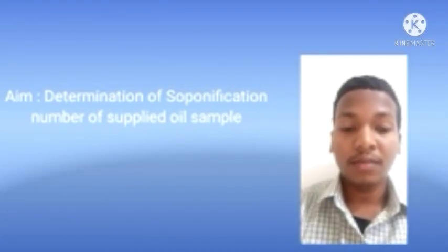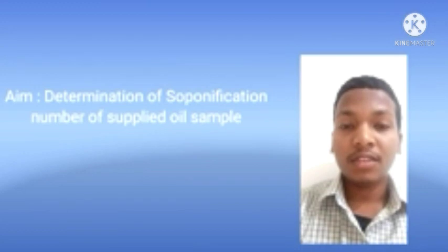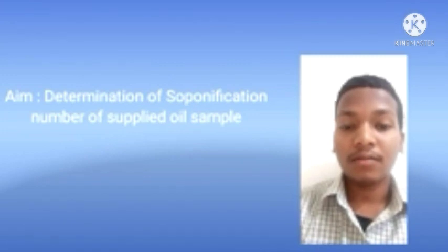The name of this experiment is determination of saponification number of supplied oil sample.